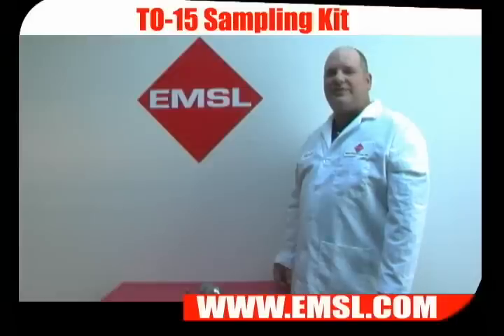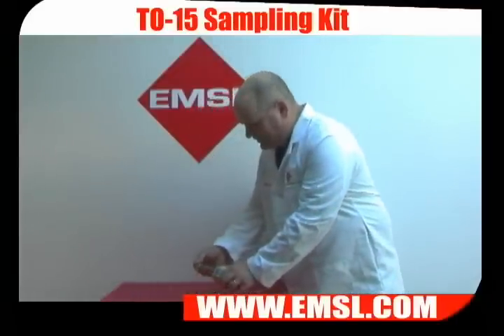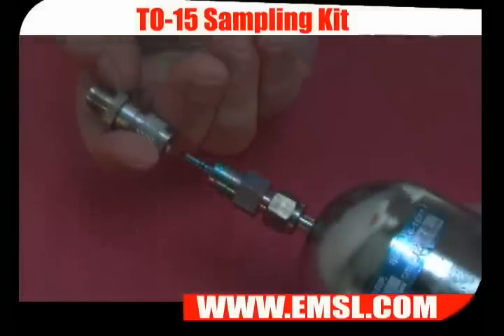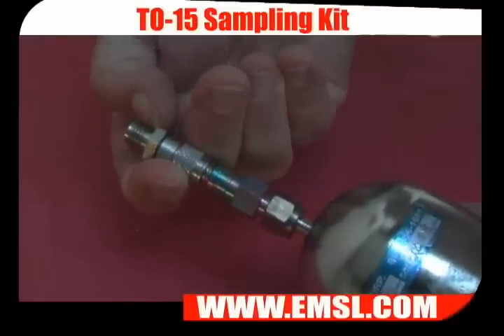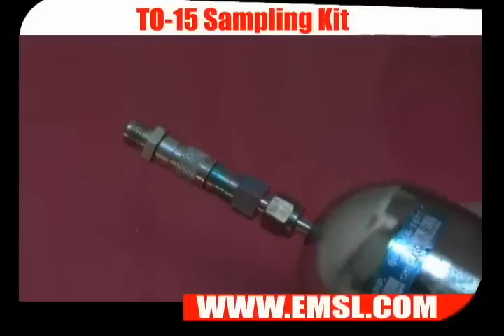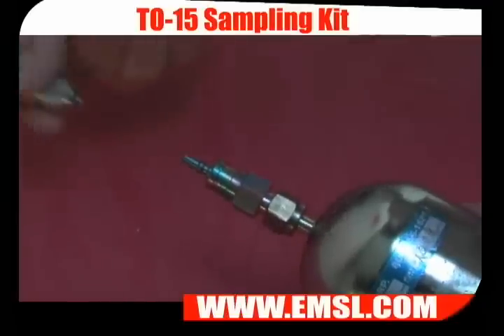To take a grab sample using a mini-can, install the sampling adapter. To install the sampling adapter, pull back the collar and push it on until it clicks. When you're done sampling, pull back the collar and remove the sampling adapter.